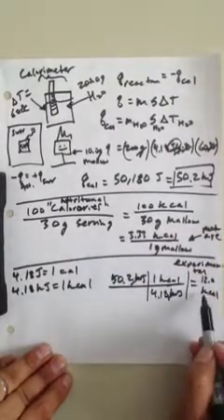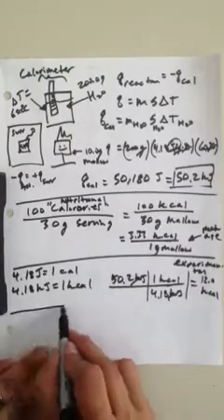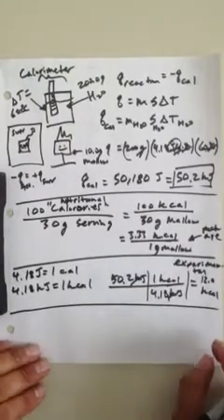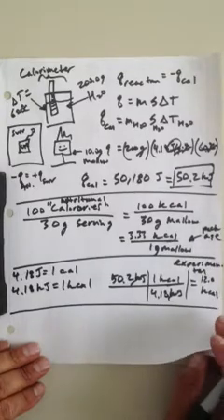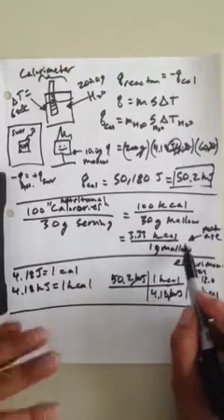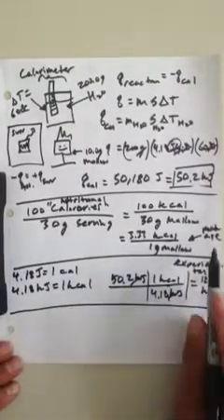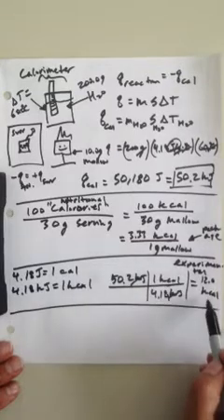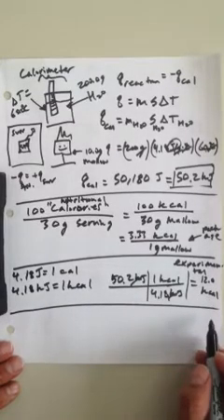And this is really the heat absorbed, and this is the heat that's in there, the enthalpy, the chemical energy that's usable as work and heat, but we're measuring mostly the heat because it's constant pressure, so it'll be the heat of this reaction, we'll call it. Okay? So this is what the package says, this is what we got. Let's figure this out a little bit more.